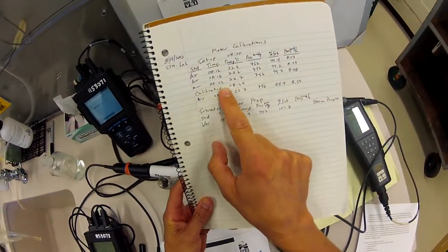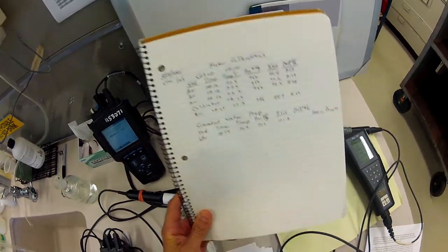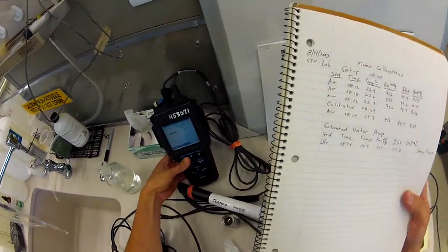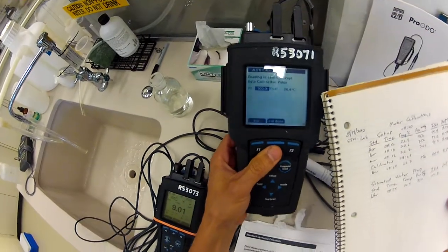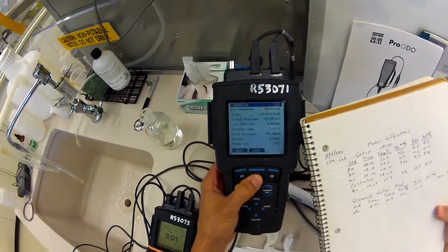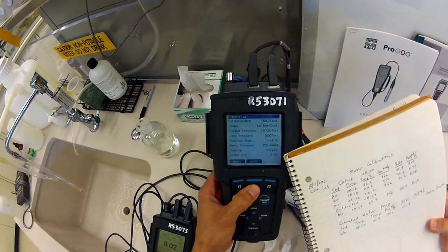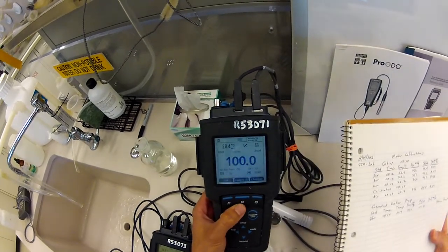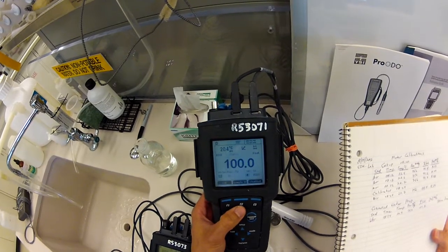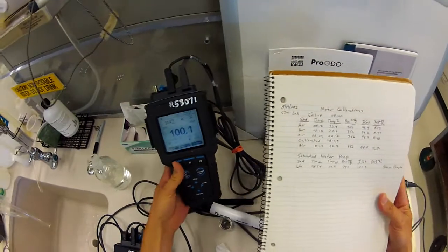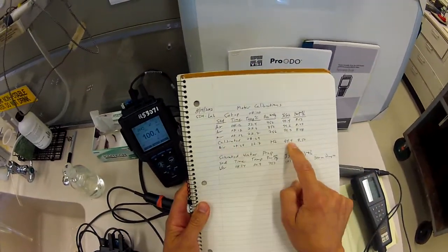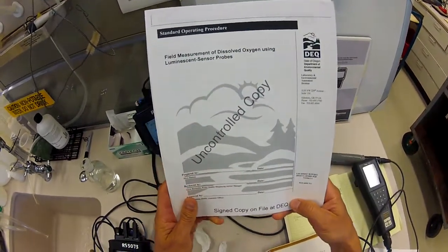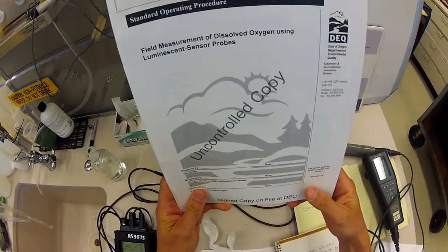Once you're done with the calibration, you record the time that you calibrated, and then don't take it out of the sleeve yet because you still need to write down your post calibration values. So our meter at this time has finished with the calibration. We hit cal done. It gives us all of the good laboratory practices data that it's going to store and that we want to keep for future reference if we need to. And now we've moved on and we're ready to record our post calibration information, and that's what we would put here. So that's the process for calibrating your meter. The next step according to the DEQ standard operating procedures is to go ahead and move on to calibration verification, which we'll cover at another time.